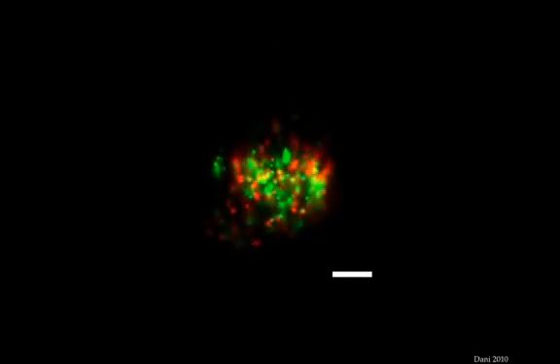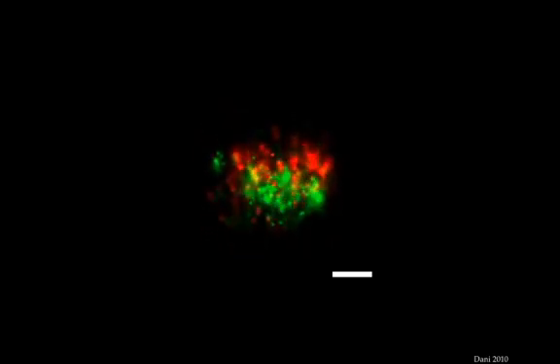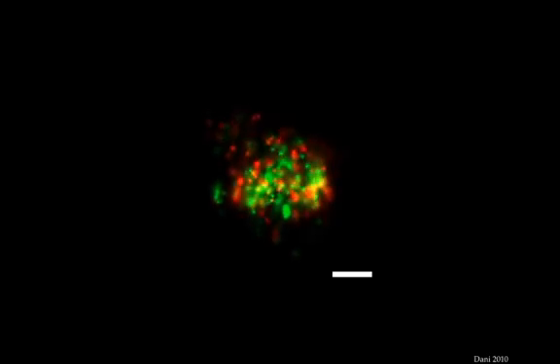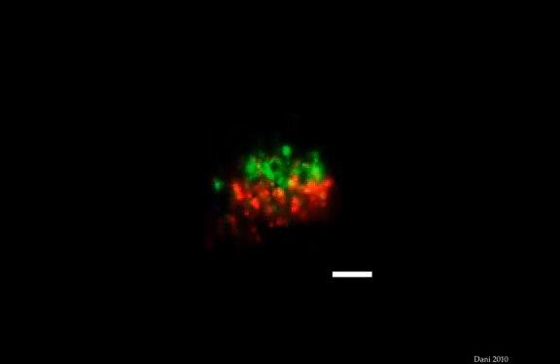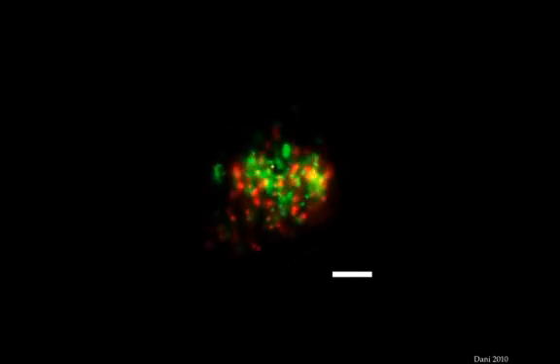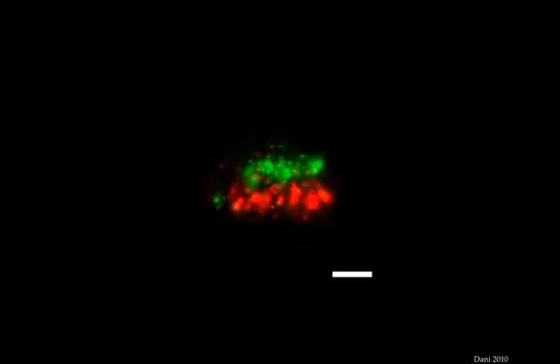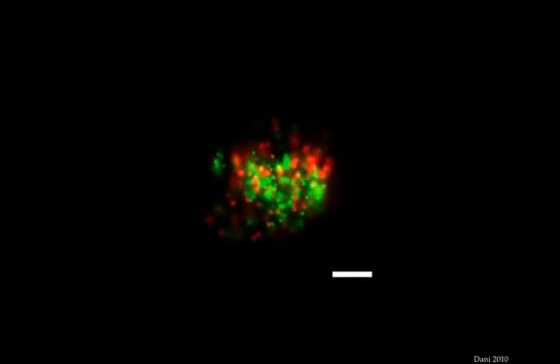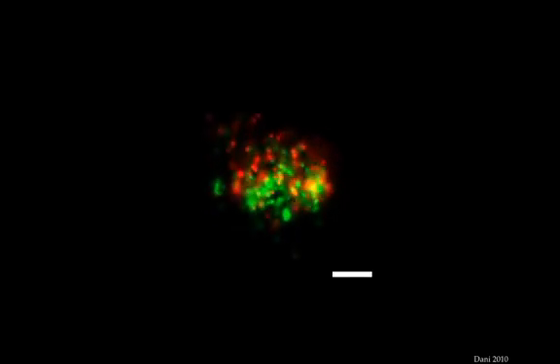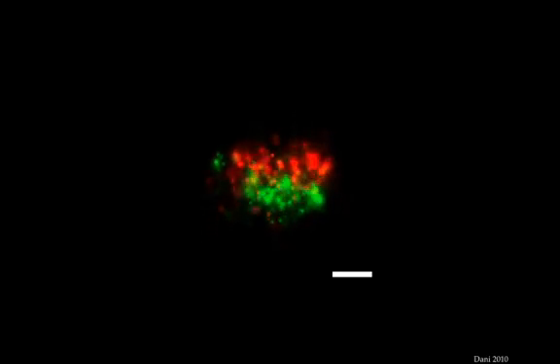This ability to span multiple spatial scales at the same time also leads to some of the most exciting applications of STORM in neuroscience. By labeling pre- and postsynaptic proteins and using 3D STORM, we can take accurate measurements of synaptic structural parameters. Since this is a relatively fast process, multiple synapses can be imaged and compiled into pretty large data sets. Then, using comparative analysis, we can reveal if there's any sort of heterogeneity or strong orientations or other measures of the synaptic geometry.